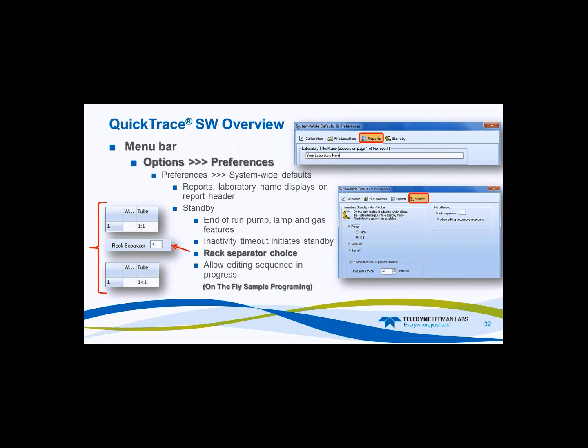and you can save reagents and rinse and chemicals. And then also we have a rack separator that's set up right there, and you can change it to anything you want. Here I've displayed using a colon and then a back arrow pointer, and how it works. So if your operating system has issues with, say, using colons or commas instead of periods and different things, this is where you can change it. This is more for the international computers and so forth.